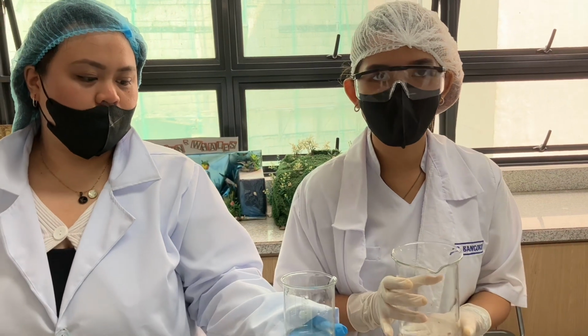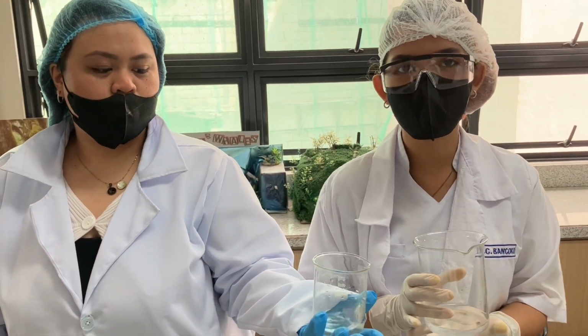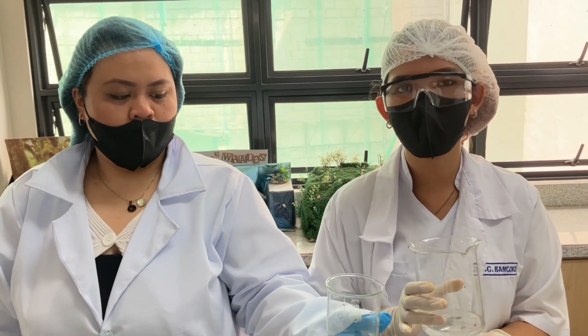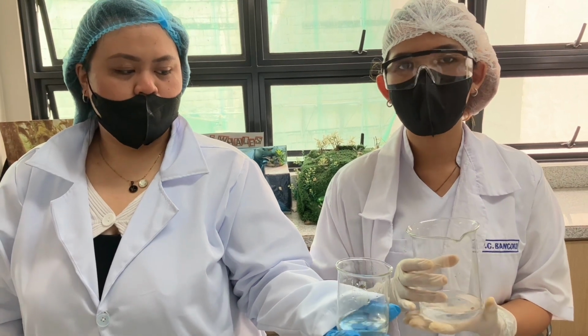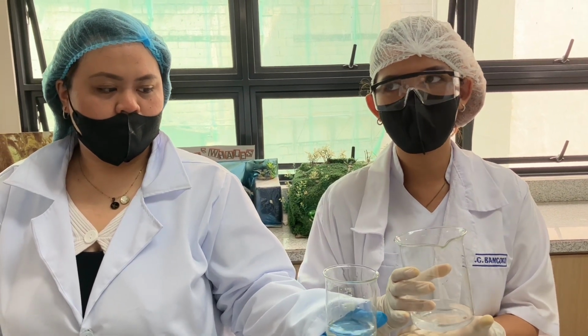Beakers are used to hold, mix and heat reagents. They are useful as a reaction container or to hold liquid or solid samples. They are also used to catch liquids to avoid contamination from the other filtration container.